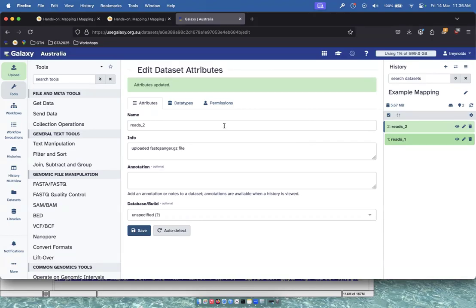There is a dedicated quality control tutorial for dealing with sequencing data. And in this tutorial, we will not repeat those steps, but you should go and follow that tutorial to apply quality control to any real data you're using in Galaxy before going on to the next steps that we will go straight to now.